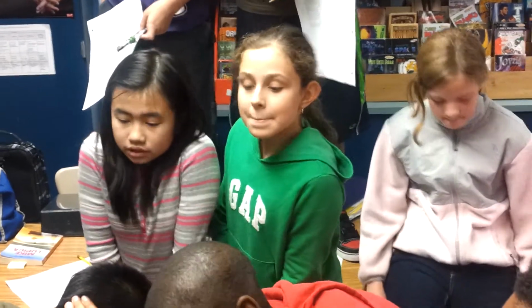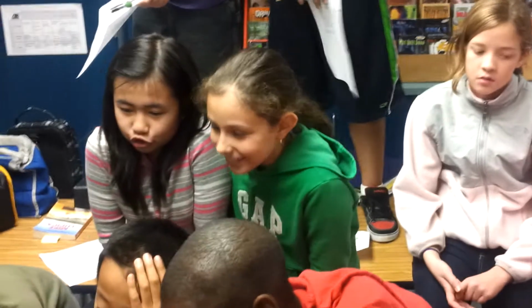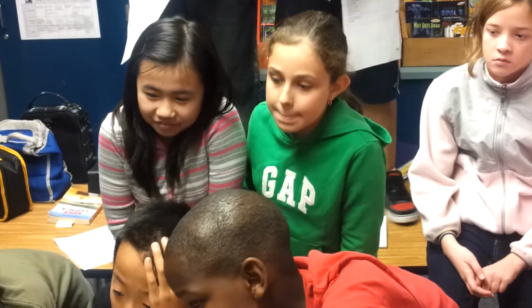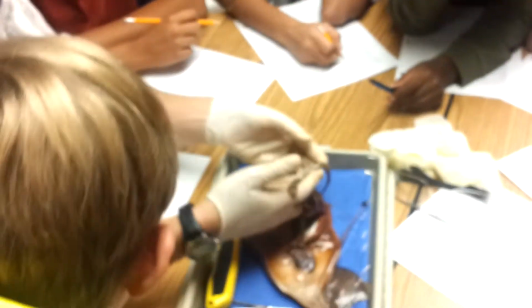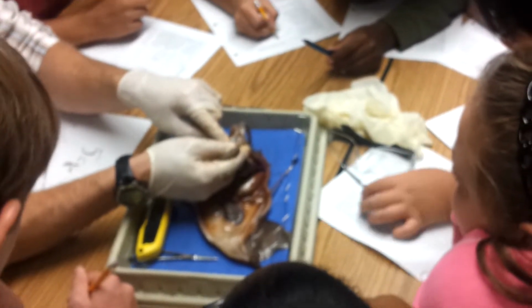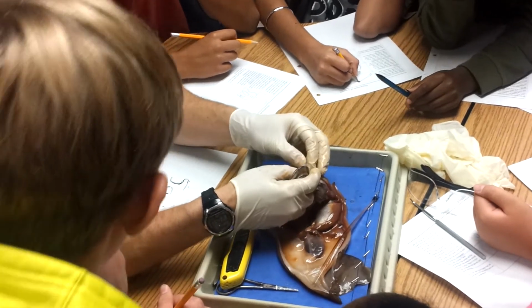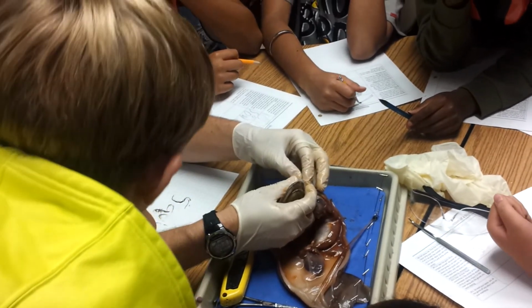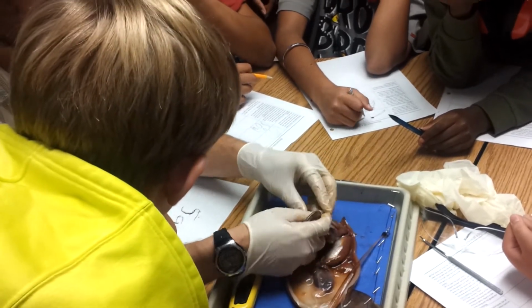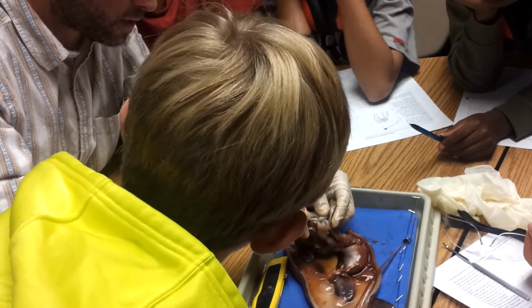Now, I think it's looking down at heaven like, what are they doing to us? The last thing just before we're all done. Again, I'm going to point out, look at all these arms with all the little suckers in it. So the way this animal is going to hunt is it's going to grab things with the longer tentacles, pull them into the arms, and once the arms wrap around it, they're going to hold it while the beak eats it up. Okay? I want to see what's inside of it. There's just lots of juices and stuff, just like the inside of you.